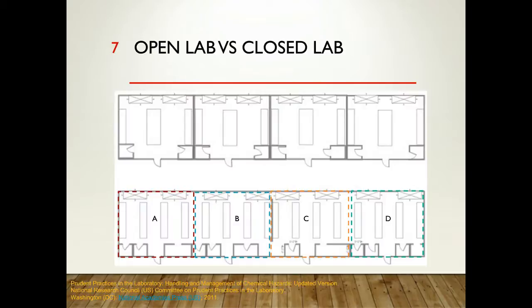So in recent years, there's been a lot of push towards an open lab design versus the traditional closed lab, where each PI or researcher has their own space with a door and four walls, and they're confined to their space. There are advantages and disadvantages to both systems and design methods. The intent for the open labs really is to allow for flexibility and encourage interdisciplinary and collaborative research. The downfall with that is that it's difficult to isolate the various hazards that are present when you work in a lab with an open design.